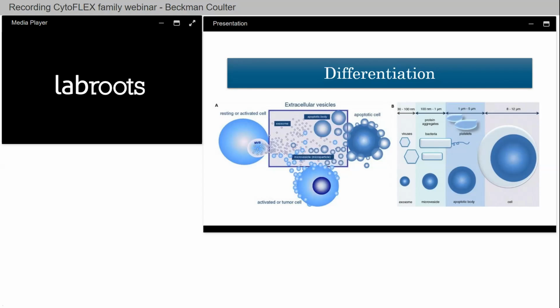It's as we start to creep down into the weeds of size and limited detection that we start to see more of the issue, and how we actually work around that. A lot of this talk is going to be ways to work around limited detection, and also just understanding what it is and how to deal with it.